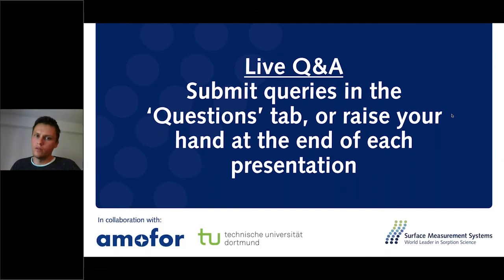And they are then, first of all, fully predicted, just a blind guess to make the first ranking. And if we want to make the validation, for example, of a lead formulation, we go for DSC or DVS measurements and confirm that with these selected measurements, and also make sure that the computations are right. And I showed also in this phase diagram composition that there is certainly a scattering. So depending on the model, these predicted solubilities might be lying in a certain range, and in order to really make sure what is the correct one, this is then a question for the DVS measurement.